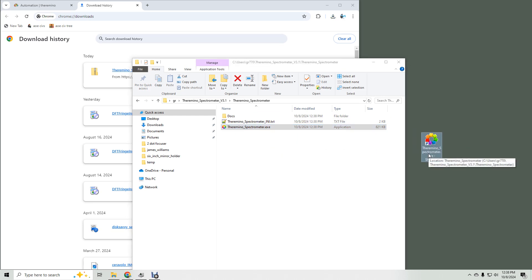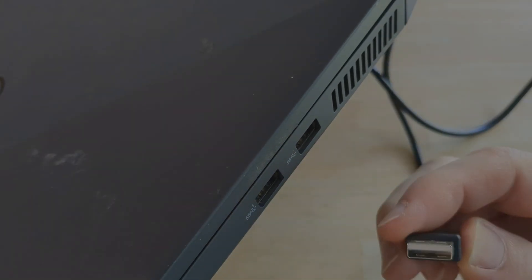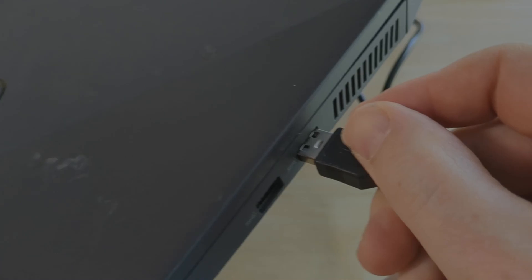Before we start Theramino, plug in your device. The USB cable that came with it was a bit loose and worked great on my laptop but not on my desktop. For my desktop, I had to use a cable I already had. When you plug in the camera, you should hear a sound.